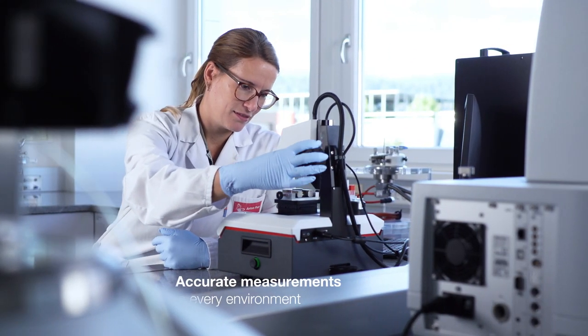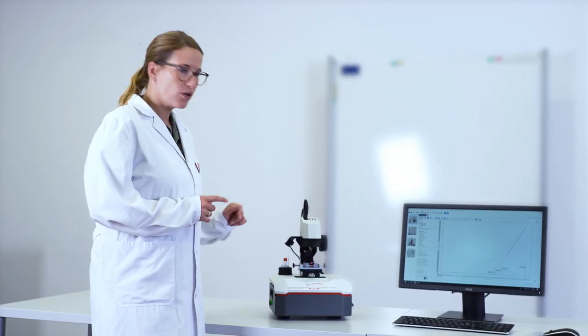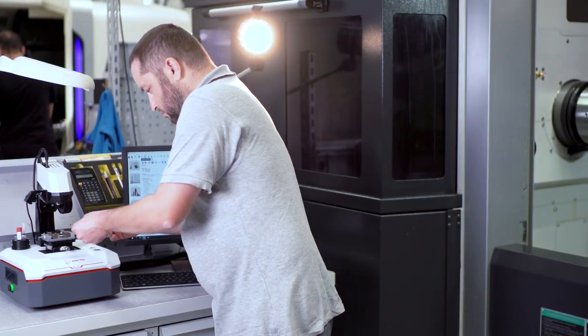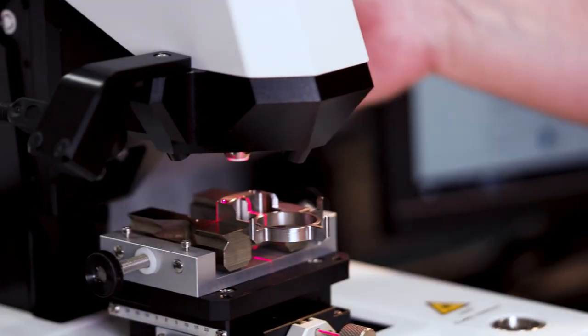To the lab, to seminars, or even the production line. In the toughest environments, HIT stays calm with active anti-vibration out of the box.